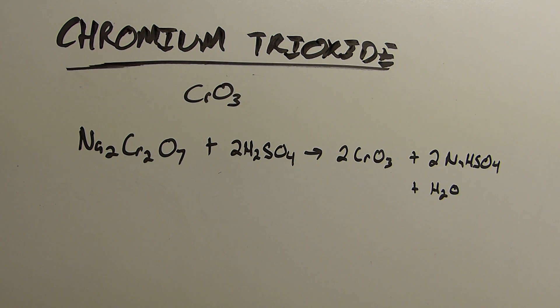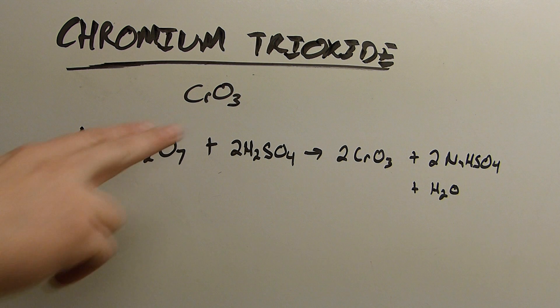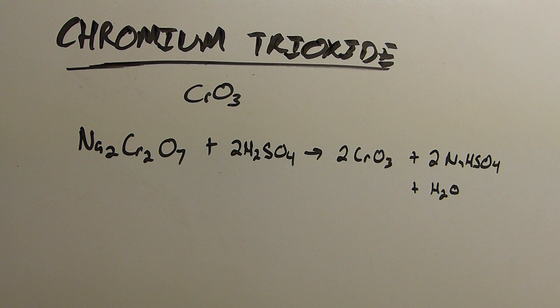In this video I'll be making a compound called chromium trioxide which has the formula CrO3. It's a strong oxidizer that's commonly used in organic chemistry in a complex of pyridine called pyridinium chlorochromate or PCC for short.